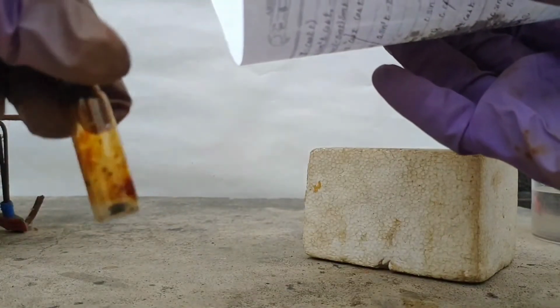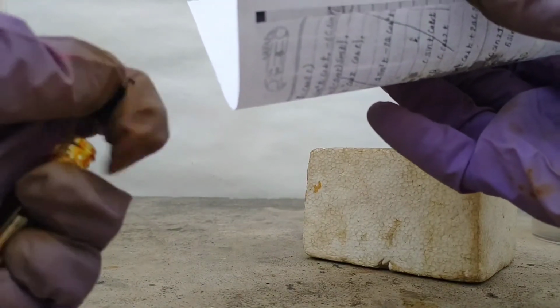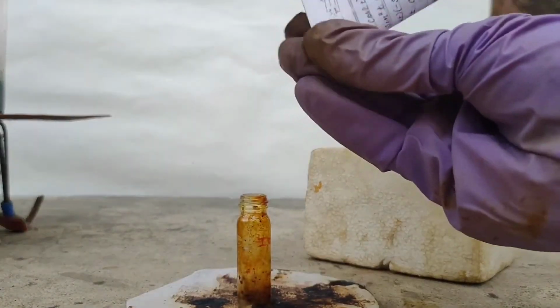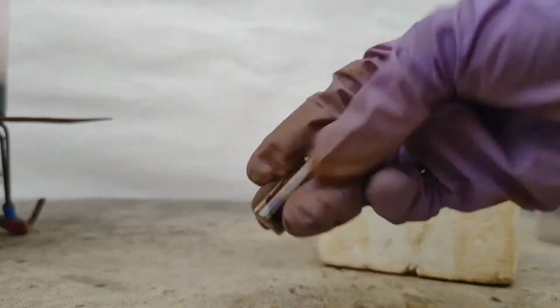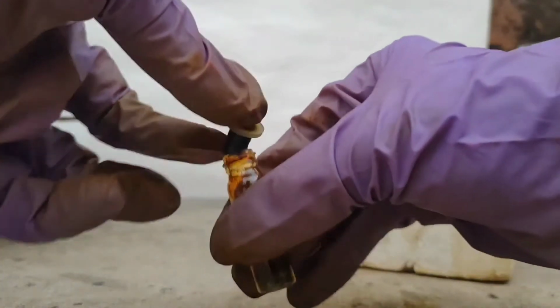I transferred these crystals into a vial containing a small amount of iodine. These many crystals I have got in the first run.